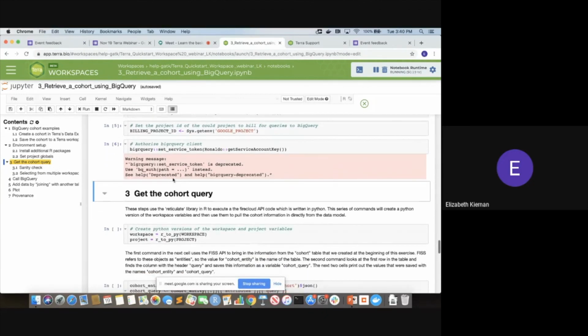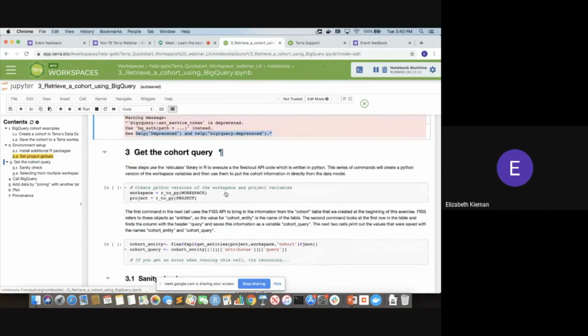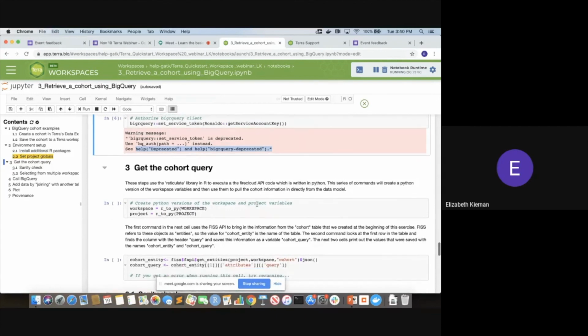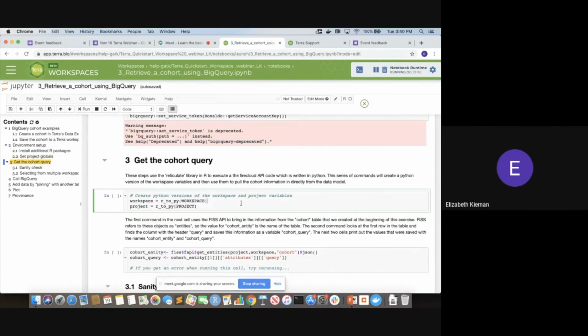A warning message usually tells you that the cell that you run has completed as expected, but it might give you certain warnings, like, for example, that certain functions might be deprecated, just in case that affects your downstream analysis. You would expect a much shorter error warning without a color-coded window if something actually went wrong. And hopefully that won't happen in this demonstration.